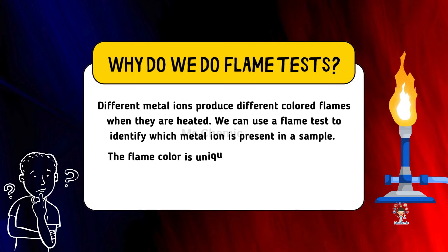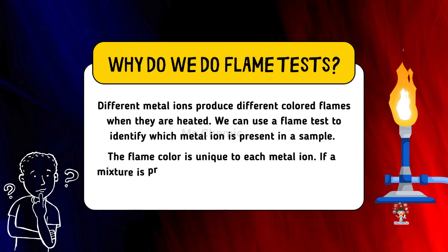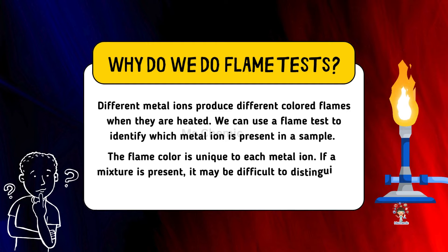The flame color is unique to each metal ion. If a mixture is present, it may be difficult to distinguish the flame color.